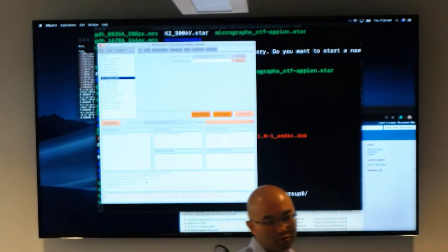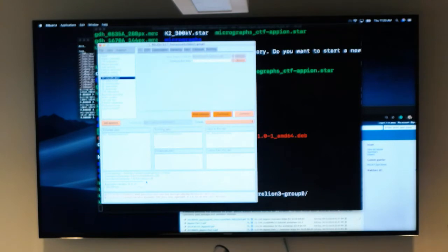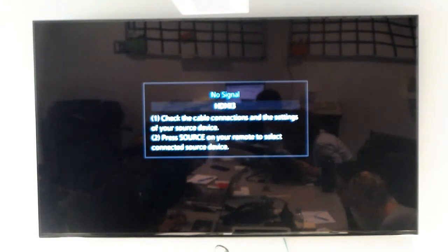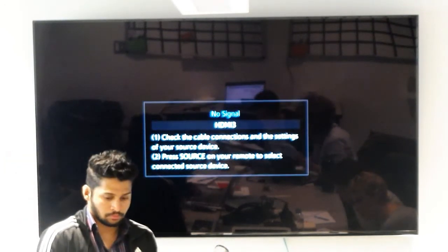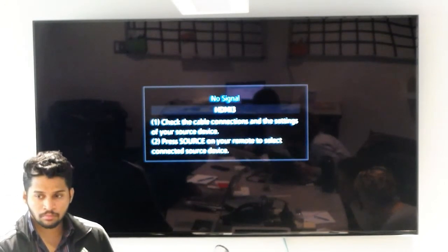So then the other thing you can try is run in CPU. Oh, okay. Stop that. You have RAM? Yeah. 240? Cool. Let's see. What we have. Okay. I don't know what this is. The GPUs, I think. RAM 1 and GPU 1 through RAM. Okay, check.